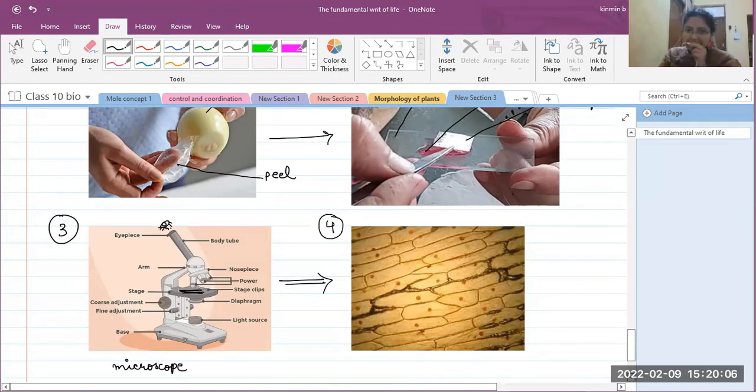We see these little compartments. Okay, what are these little compartments? These compartments are known as cells. So this is an onion peel as seen under a microscope. Okay, so what do we see here? Why did we put the dye in? We put the dye so that we can make out each cell clearly and properly. Okay, and it also stains the nucleus of the cell.